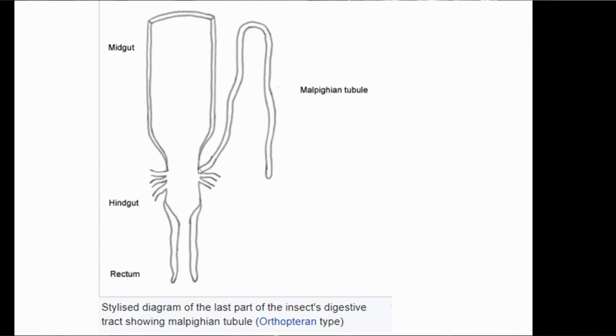So if you like, these are isolated. Now, we were lucky enough to be able to visualize them full of calcium salts, and what we wanted to know is when this area recanalized and the pupa could get rid of all that material in the Malpighian tubule.